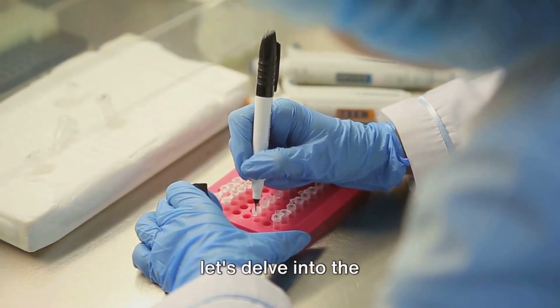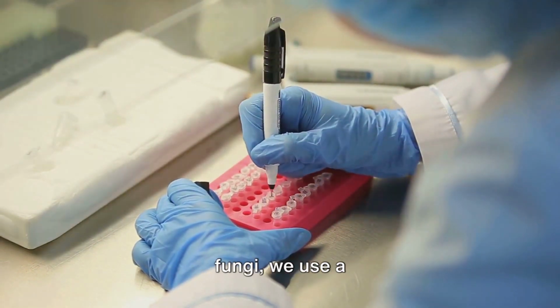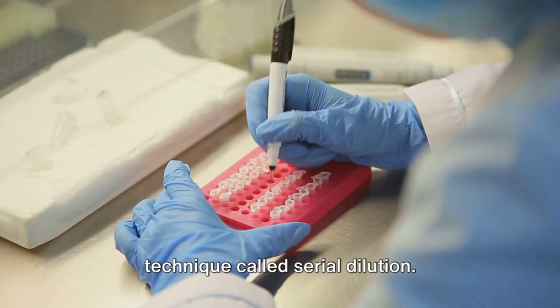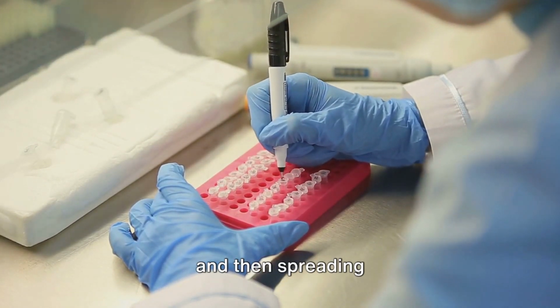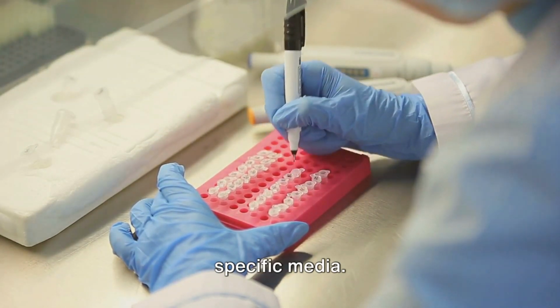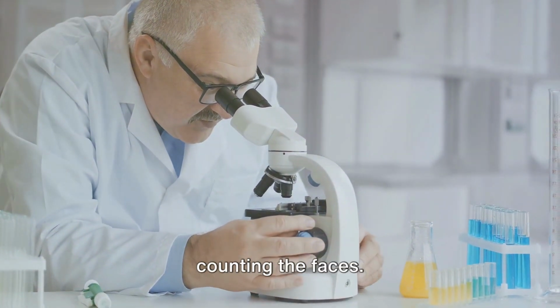Let's delve into the intriguing world of microbial enumeration. To count bacteria and fungi, we use a technique called serial dilution. This involves diluting a sample multiple times and then spreading these dilutions onto specific media. It's like taking a bacterial selfie and counting the faces.